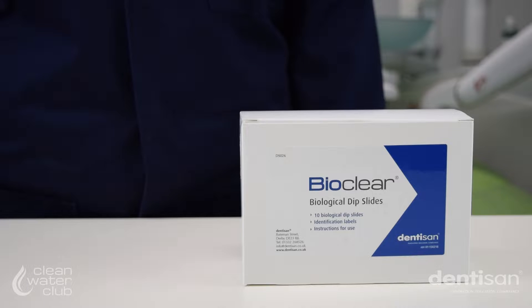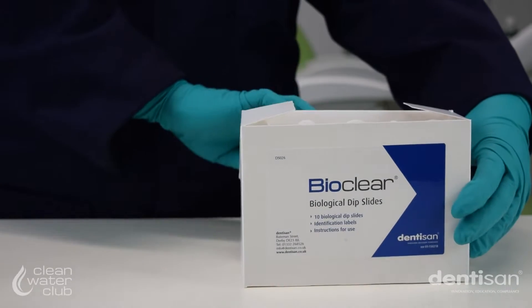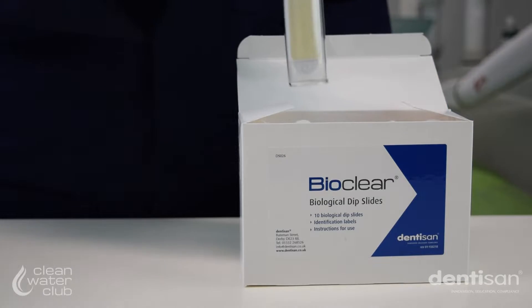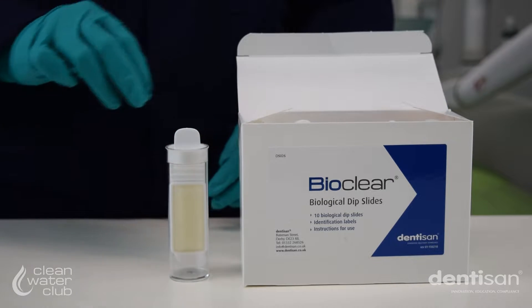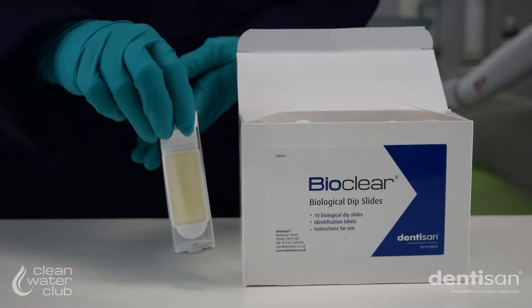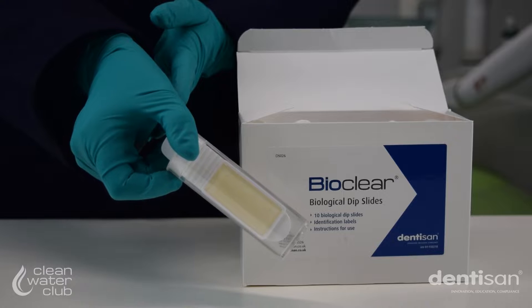We recommend using a three-in-one line. To take your samples, remove a dip slide from the packet and check both sides of the paddle for red dots. Don't take the paddle out of the container. If there are any red spots, discard and repeat the inspection with a new dip slide.